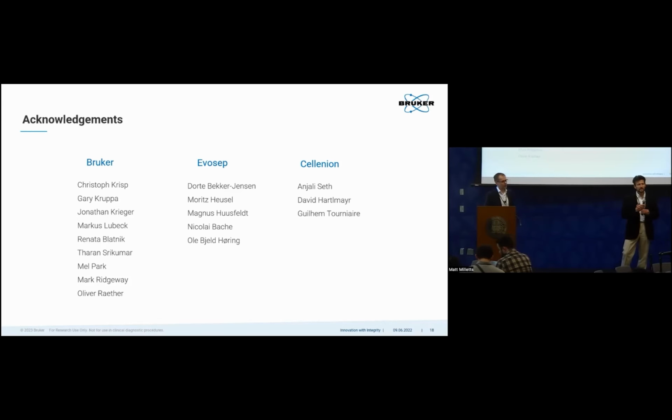And yeah, the second question was the effect of TIMS on improving that dynamic range, how TIMS helps improve the dynamic range. I think you benefit from doing that because you're focusing only on the ions of interest, right?